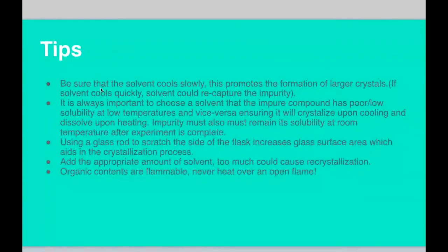We can go to the last slide. And finally, here are some useful tips. It is important that the solvent cools slowly. This promotes the formation of larger crystals. And if the solvent cools quickly, it could recapture the impurity, and you might not get better crystals.